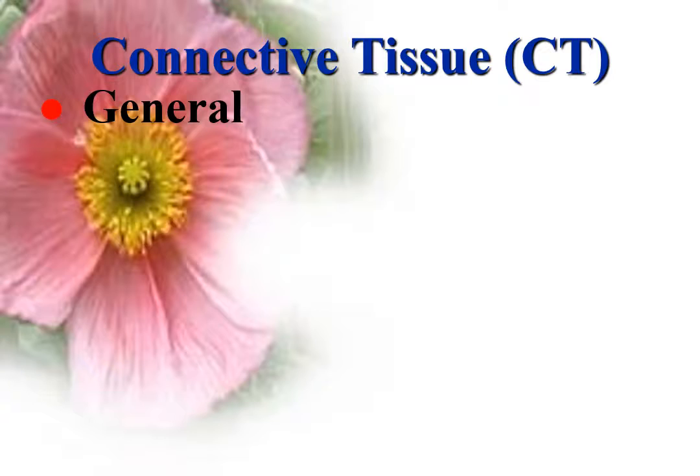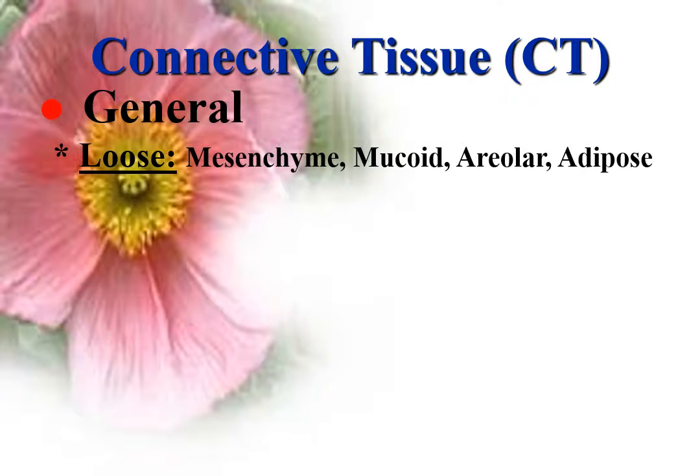Loose connective tissue is further subdivided into subtypes according to the type of fibers, cells, and proportion of the matrix: mesenchymal connective tissue, mucoid connective tissue, loose areolar connective tissue, adipose connective tissue, and reticular connective tissue.